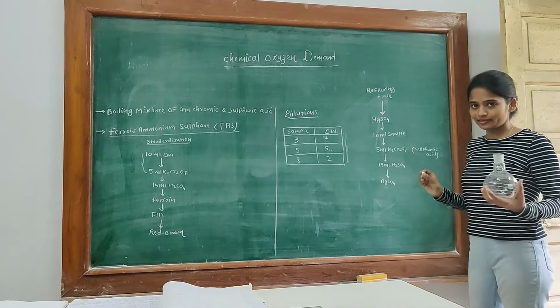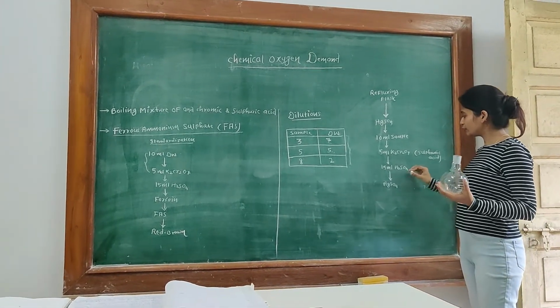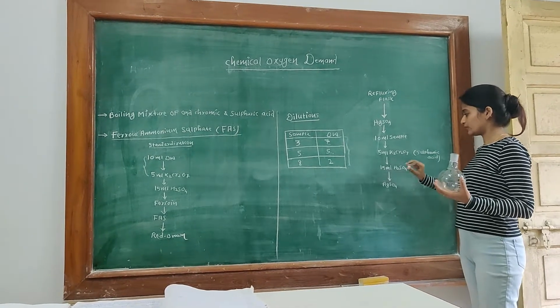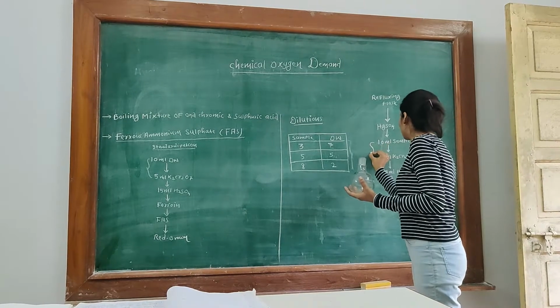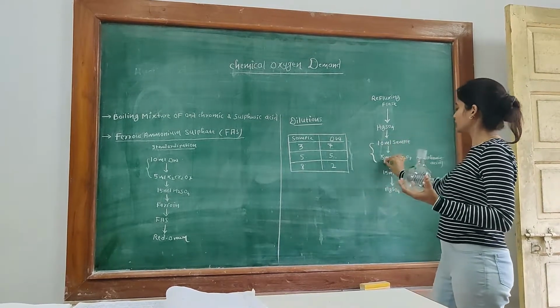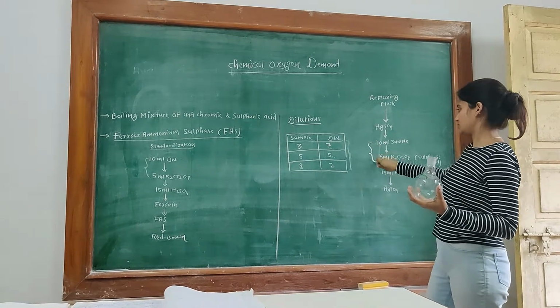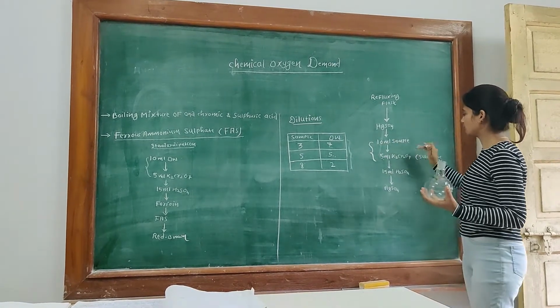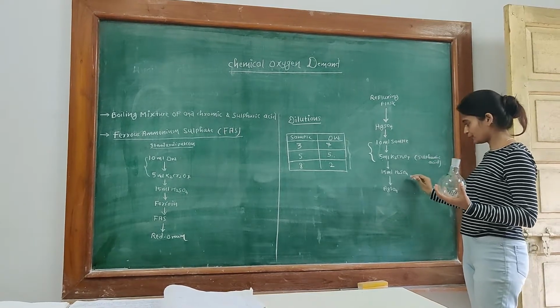See, now you will be clear about the principle. So 15 ml H2SO4 will be used, and you know this is taken as this volume, 10 plus 5. The acid should be equal to this volume of potassium dichromate and sample. So 15 ml concentrated H2SO4.